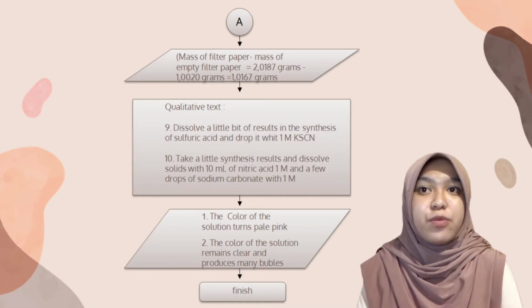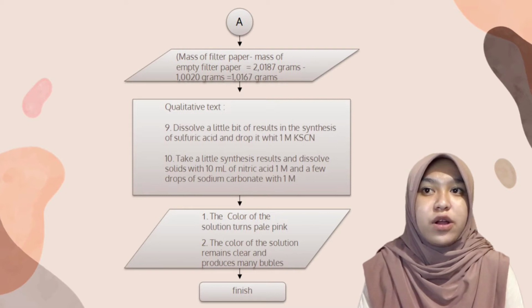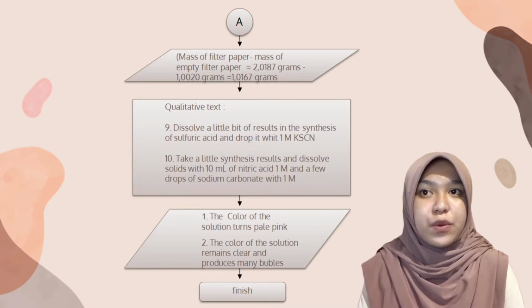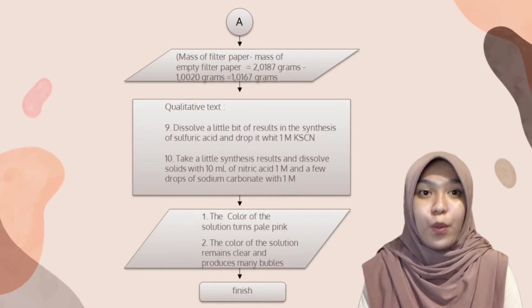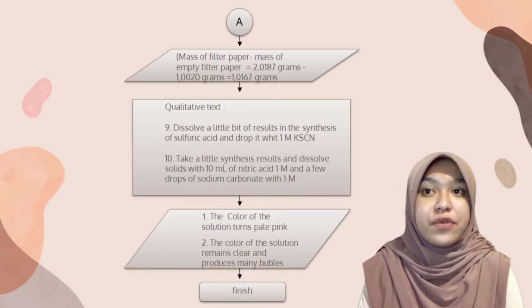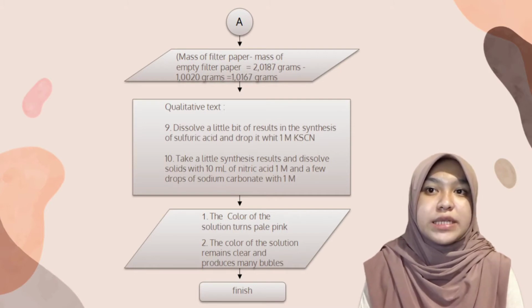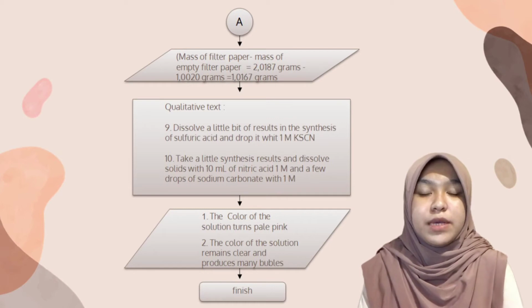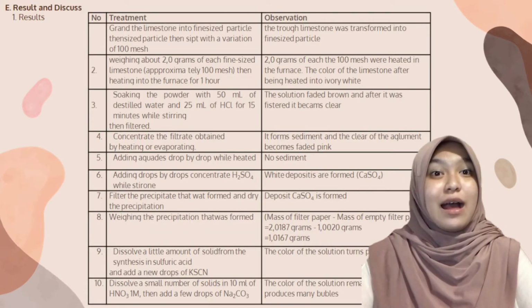and take a little synthesis result and dissolve the solid with 10 ml of nitric acid 1 molar and a few drops of sodium carbonate 1 molar. Next, the color of the solution turns pale pink, and the color of the other solution remains clear and produces many bubbles. Next, results and discussion.